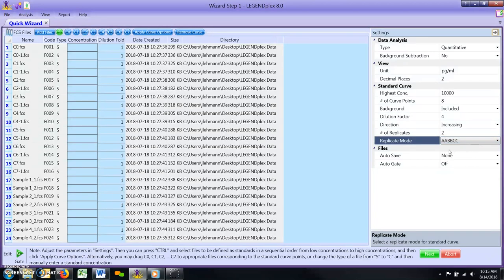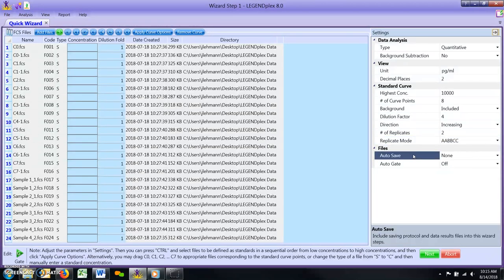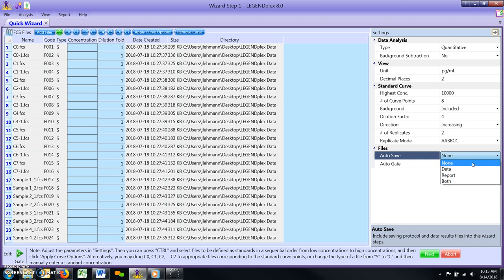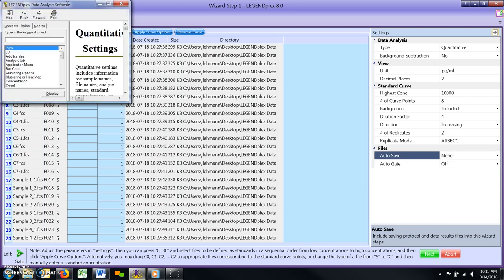Autosave. This feature can be adjusted to have the software automatically save an output report, a data status file, both file types, or none. There are other features that may be adjusted within the settings window. However, the instances that would require changing these default settings are limited. For more information about these settings, please press the F1 key and then search for the term Quantitative Settings.